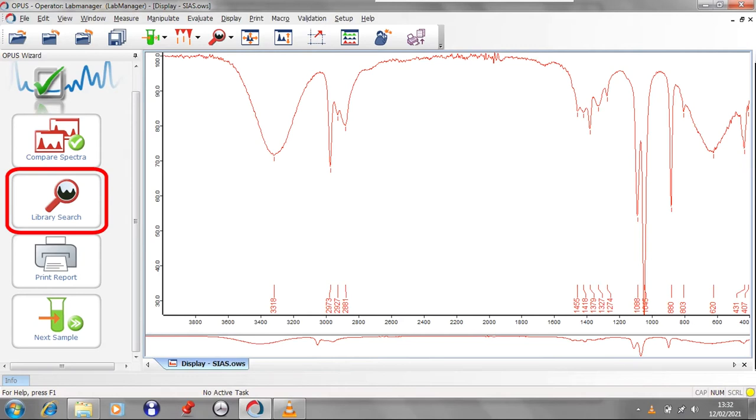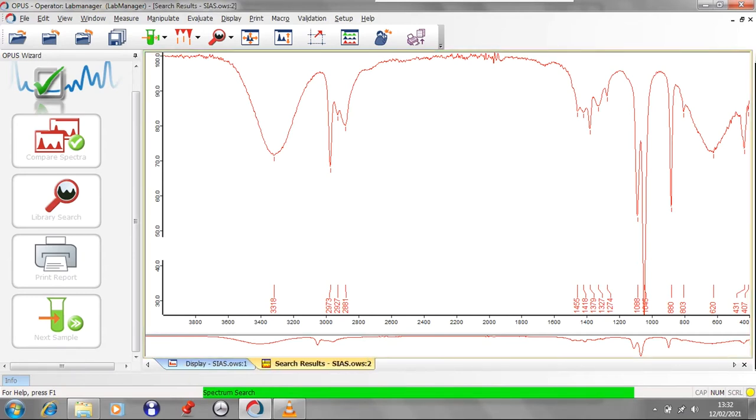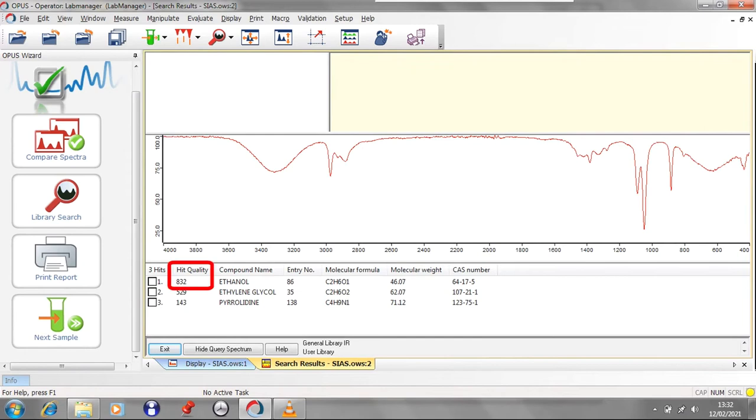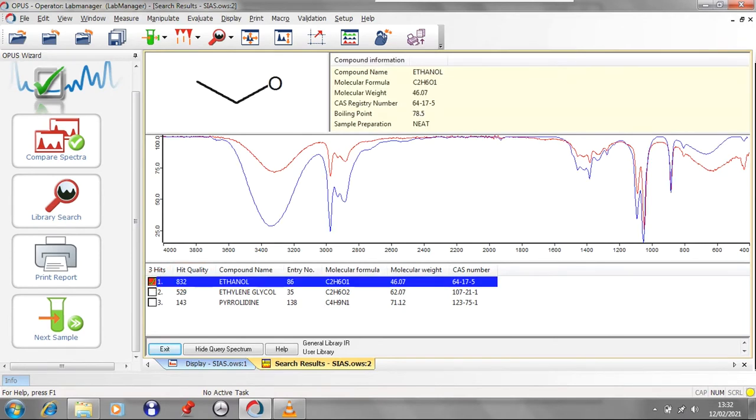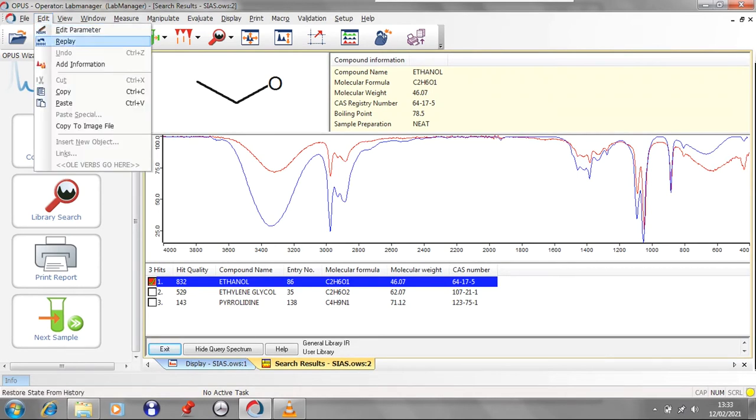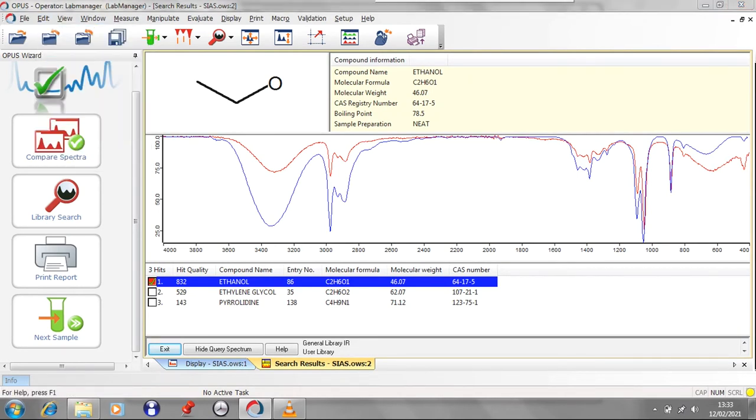Once you have your spectrum, click on the Library Search icon on the left of the screen. This will automatically compare your spectrum to those held in the program's library of compounds and give you a number out of a thousand for hit quality - in other words, how well it matches to the spectrum within the library for that compound. Click on the checkmark and it will bring up the spectrum from the library to compare with your own.